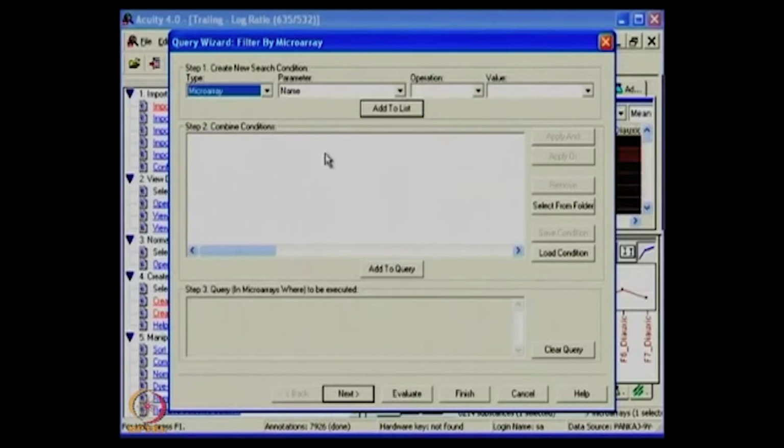Say for example, quickly, here I can define which experiment type I want to do, or based on the parameters as such, I can say that I want to import the data in the form of only one particular parameter. This is a little tricky, because if you have the same name multiple times, the data will be imported twice. So you need to make sure your folder is right, and that you have given only one copy.